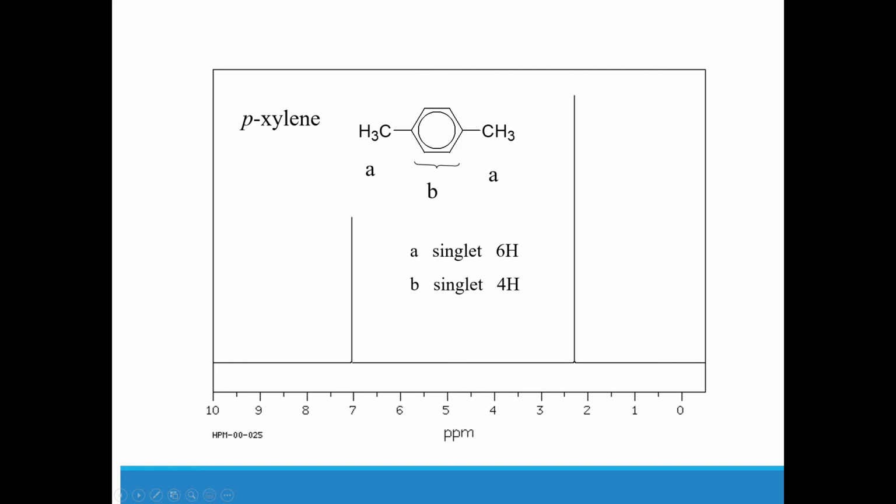So for that dimethylbenzene or p-xylene, we expected 2 signals. So let's start with our methyl groups. Because they're sp3 hybridized, they should be more upfield. They should have a singular peak because they are singlets. They have no neighboring hydrogens. Meanwhile, the hydrogens in the benzene ring, they are also singlets, but they should be more downfield.